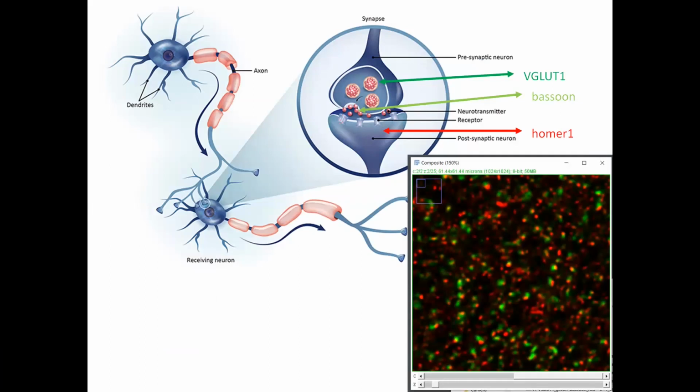What I would like to try to do with you is perform the segmentation of the images, and then do a little bit of colocalization analysis. I will wrap this into a biological question, so maybe you see more of the approach one can use.